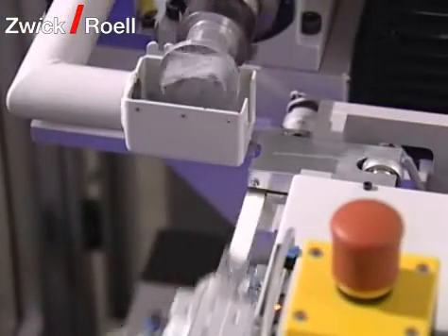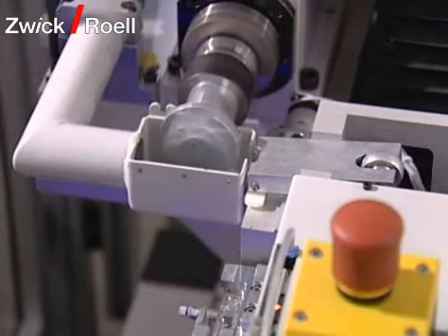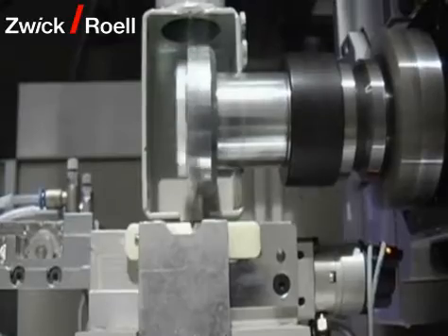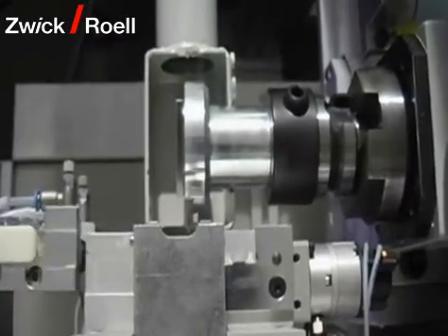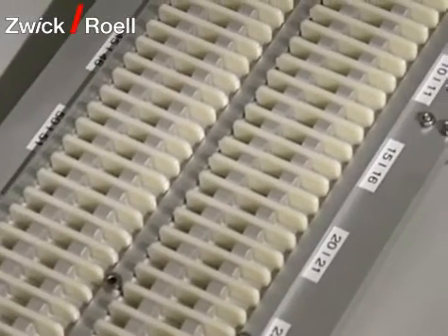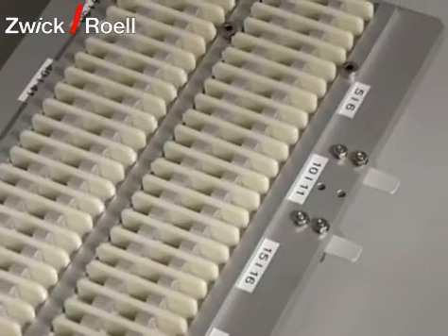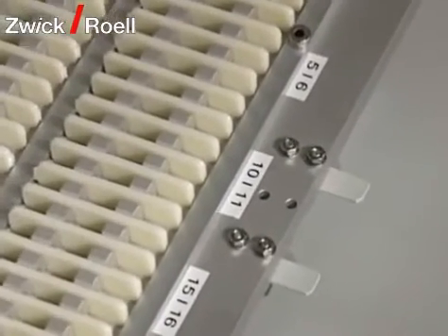Because of the integration of a notch milling unit, the specimens can be placed in the machine immediately after production. The machine automatically makes sure that the specimen rests for the required time after the notching process. The variable specimen magazine can hold up to 180 specimens, and the single magazines can be identified with coding slips on the specimen grips, which avoids any confusion.